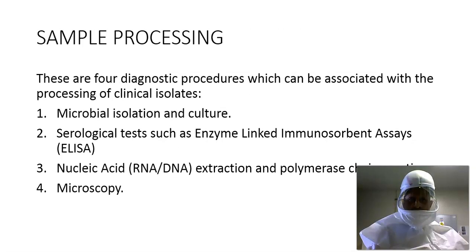Sample processing. There are 4 diagnostic procedures which can be associated with the processing of clinical isolates. The first procedure may involve microbial isolation and culture. In this case, the laboratory technician will perform a serial dilution of the sample and culture the biological agent on a selective medium or isolate DNA directly from the sample itself.